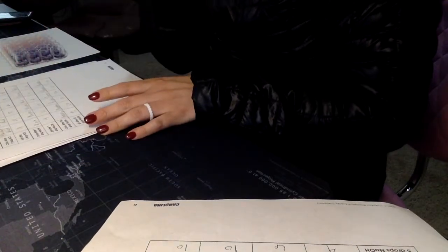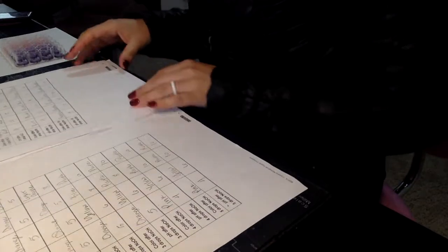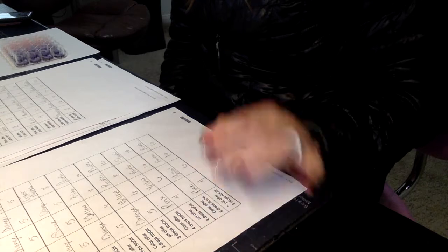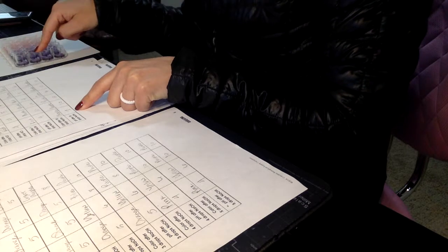For data table number 1 and data table number 2, I got a pH of 4 at the very beginning, and then I worked my way out until it turned into 5.